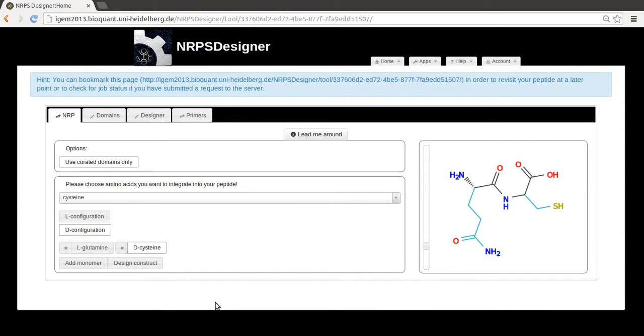Welcome to one more video tutorial for the NRPSDesigner. As has been mentioned previously, one of the goals of the NRPSDesigner is the elucidation of the functional role of domain boundaries. For this reason, you have the option to manually adjust the boundaries of domains produced.